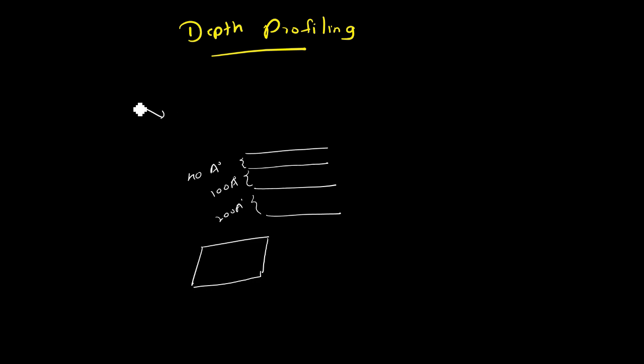We send some high energetic electrons, remove some electrons, bring an upper level electron to a vacancy, and then an Auger electron is emitted, and we calculate the Auger electron. I will not go through the detailed Auger process. That's why I have put the link here, so you can watch the detailed process.